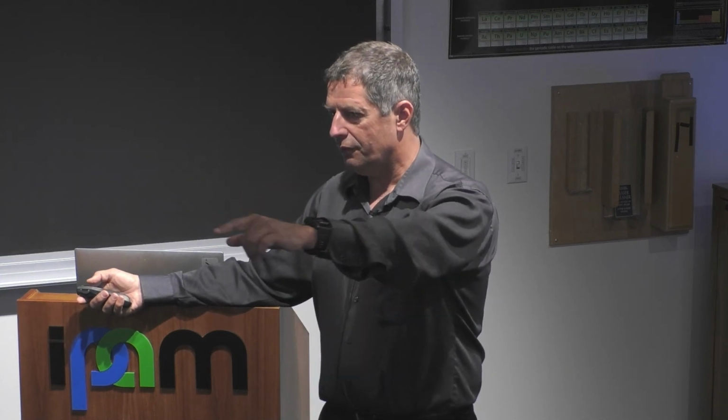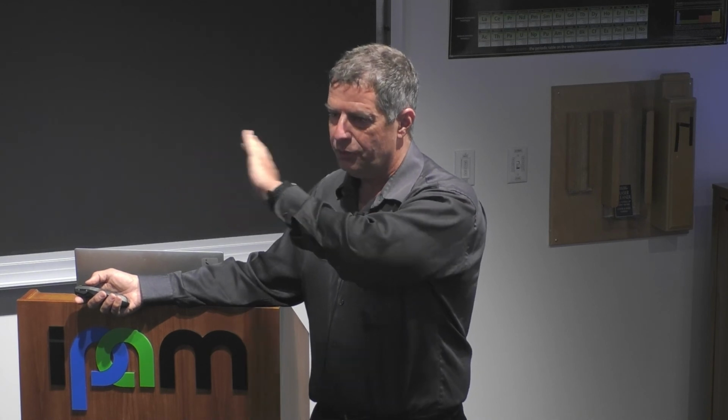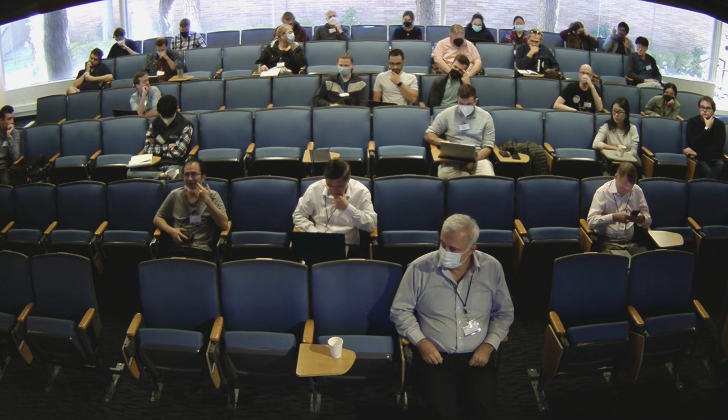But in our case, as long as you've set that, if you're doing a conventional scan, we're just listening to when it's actually collecting data. So if they've set up the conventional scan so that the flyback is all good and done, and you've established momentum and are in a nice, uniform lag, then the timing and the collection is your clock.